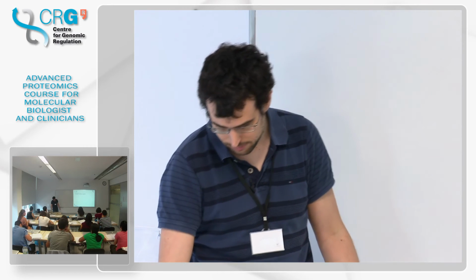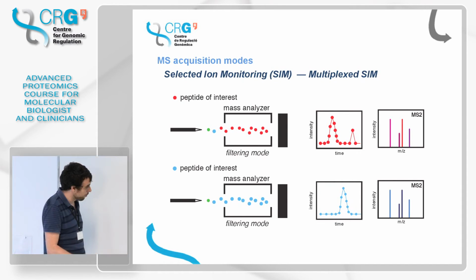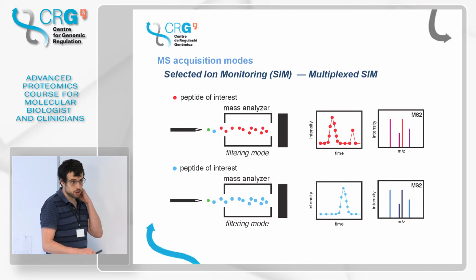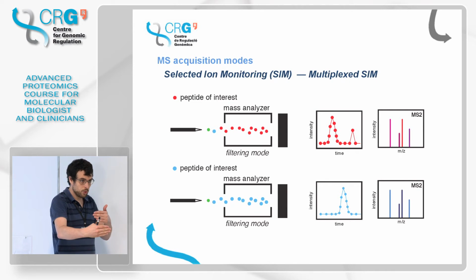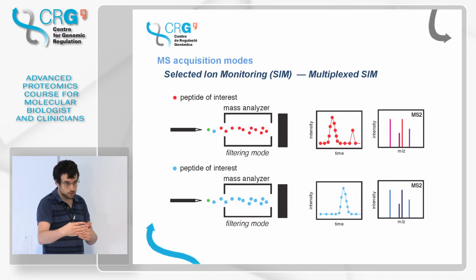If these two overlap each other, can you still multiplex? Yes, I can. Even if they are overlapping, I can multiplex because I don't need to monitor constantly. I only see whether it's there or not once every second. So I have a whole second in between one measurement and the next to do whatever I want, and I can use this second to monitor another one.